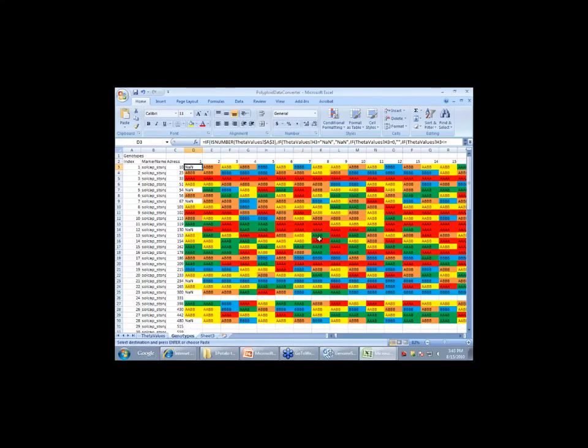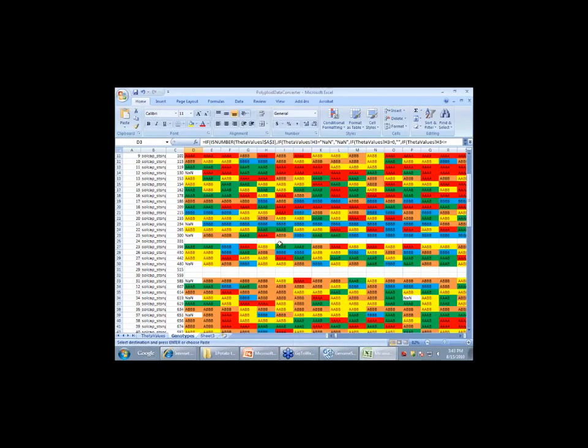But those are your genotypes with the 4 alleles that it was able to capture for this set of SNPs. Some of these, the SNPs didn't work, so you can see some blanks. So the clusters were no good, or those SNPs didn't have good data. So they're blanks. This Polyploid file converter is specific to the 96 SNPs only.